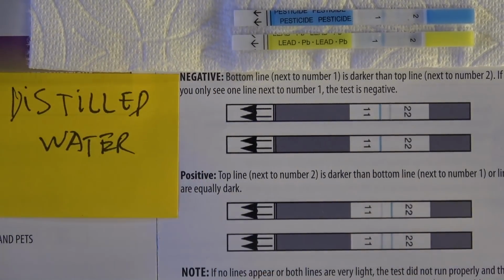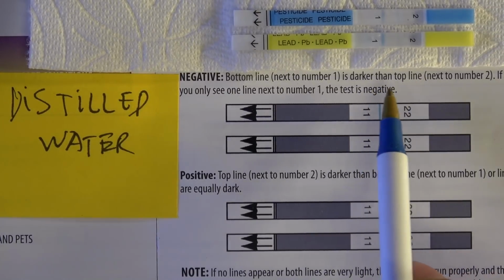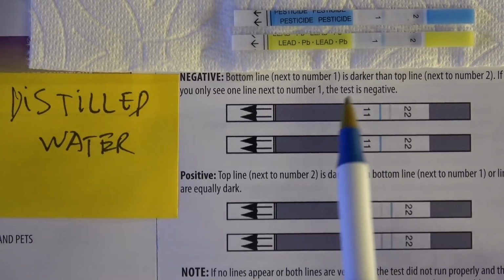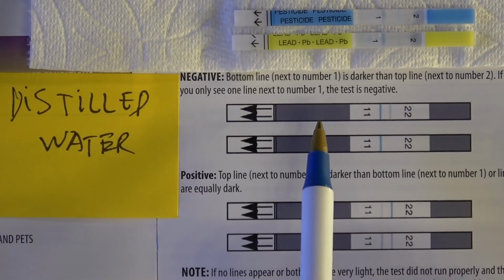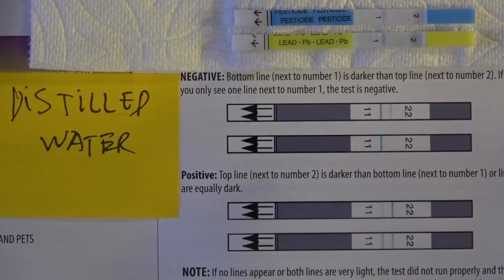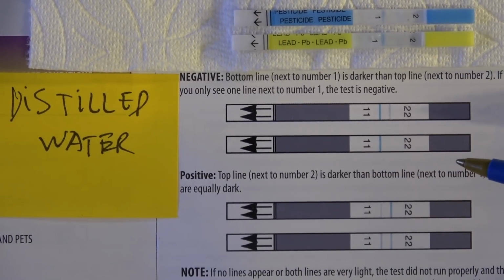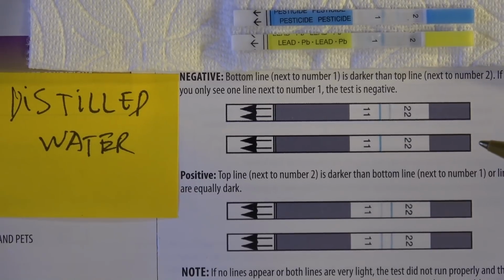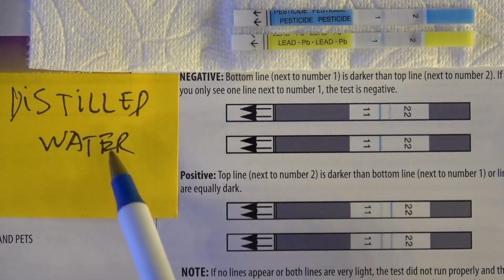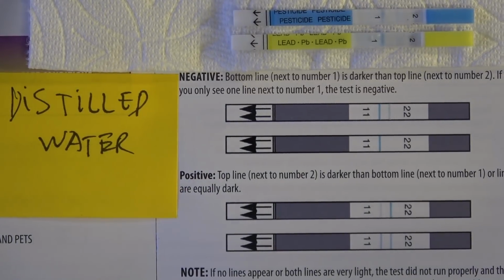A negative result is either the line 1 is darker, or there's no line on 2. The line on 2 is very dim on the pesticide, so that also means it's negative. So that means the distilled water removed lead and pesticide, everything.